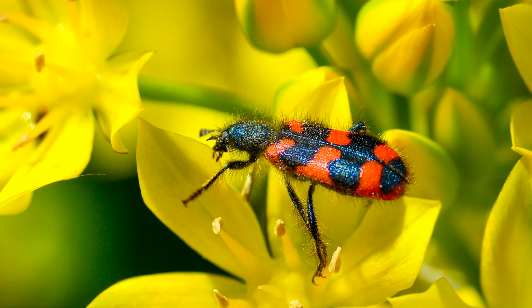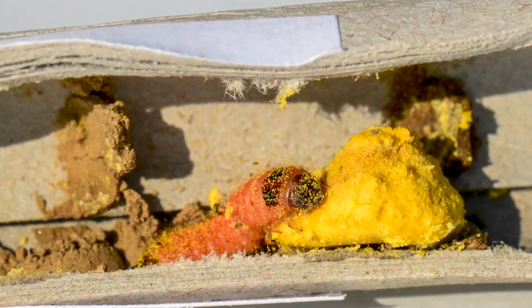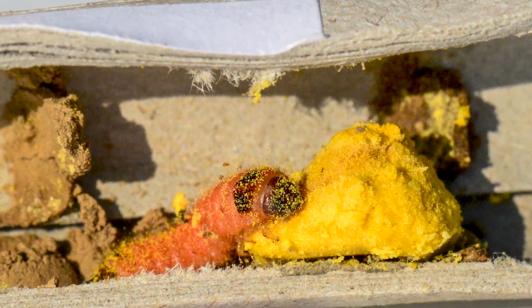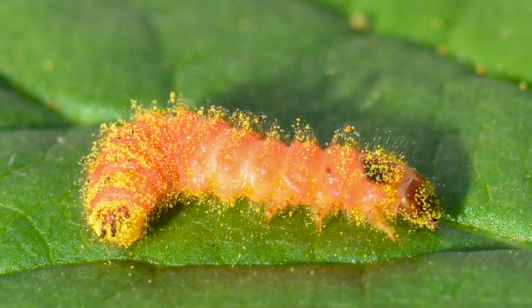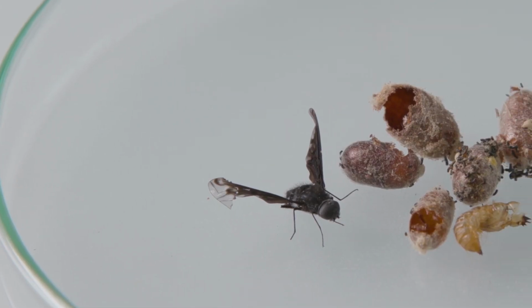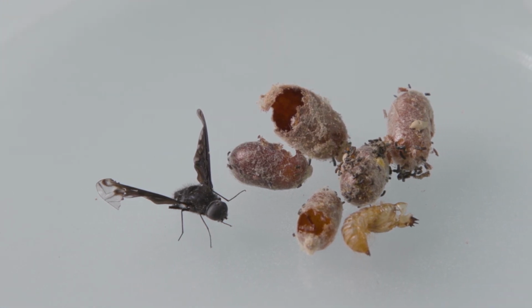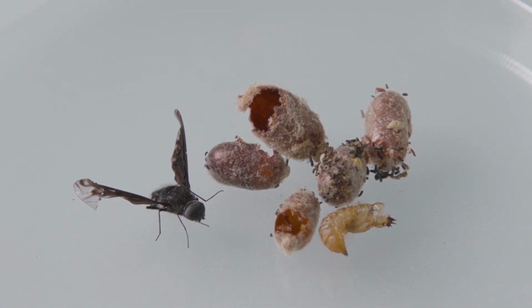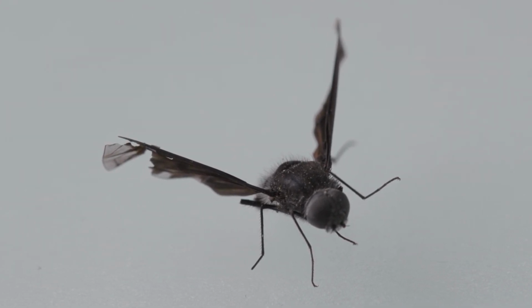Another common natural enemy of Osmia bees is the predatory beetle Trichodes apiarius. Its larvae can be recognized by the pink color and large size. They predate on the bee brood and can destroy several cells and whole nests. The bombyliid fly Anthrax anthrax is a common parasitoid attacking Osmia offspring but after the spinning of the cocoon. It therefore can best be detected when it hatches from the cocoon in the next spring.